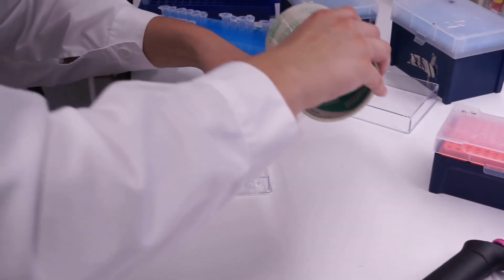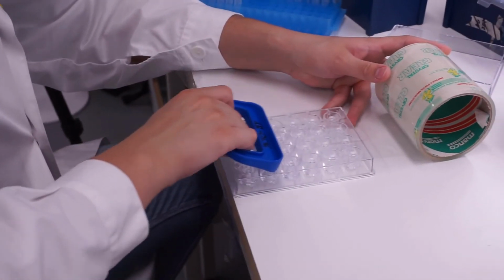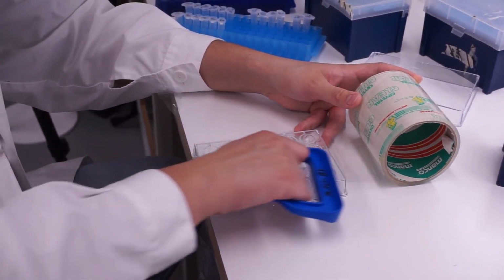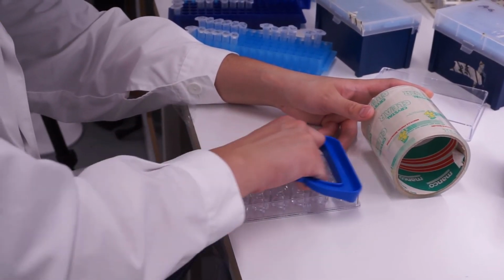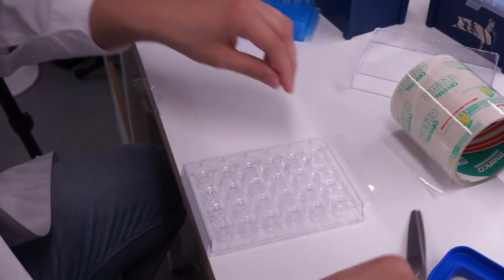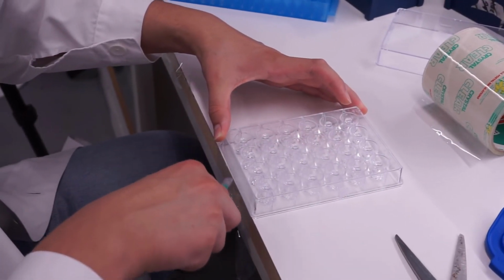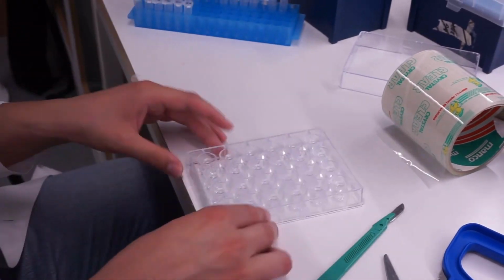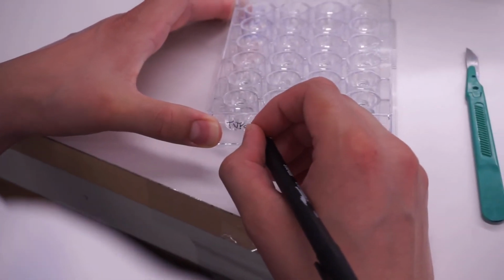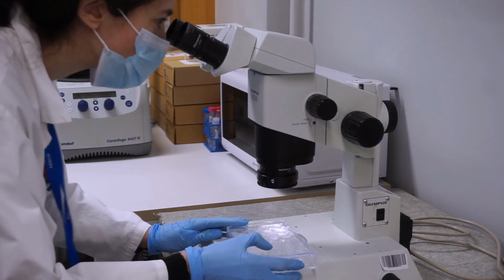Seal wells with a white crystal clear sealing tape. Put the plate at room temperature for crystal growth. Inspect the drop every day.